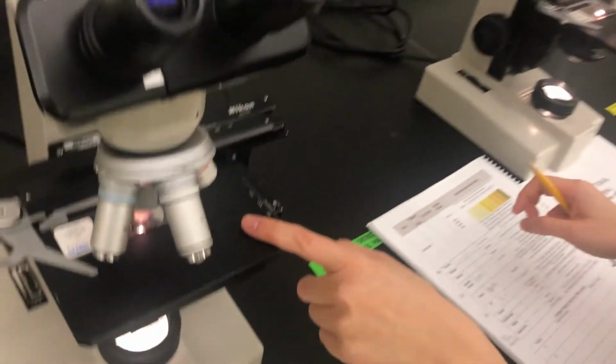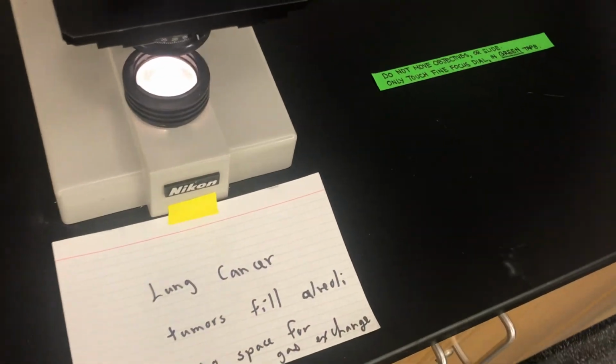the specimens, if we can see any of them. So this is a specimen of healthy lung tissue. Oh, yep, so you can see the healthy lung tissue there. It's very, very thin-walled alveoli, and the bigger, thicker red circles are bronchioles, right? So that's really nice right there. Okay, so we're going to move on to emphysema, which is right here. It's a little bit harder to see, but you can see the alveoli are a bit enlarged.